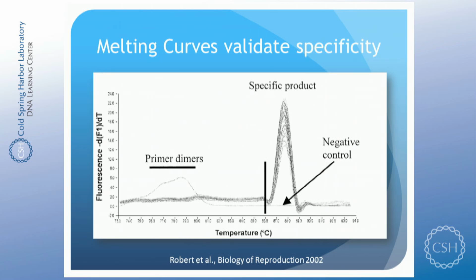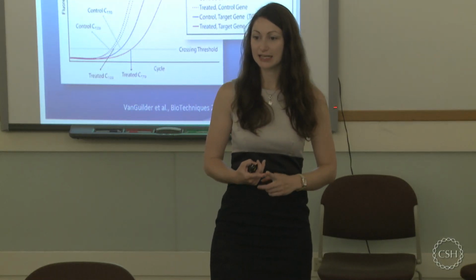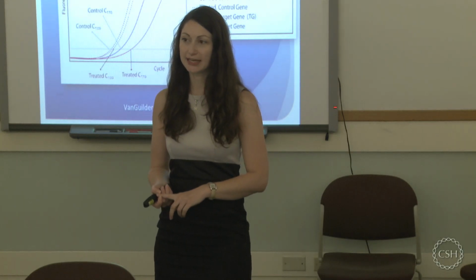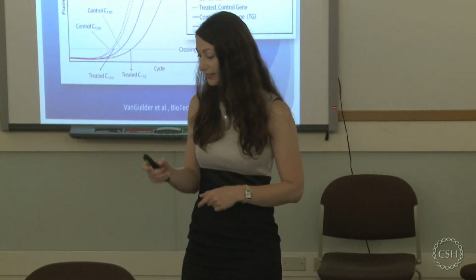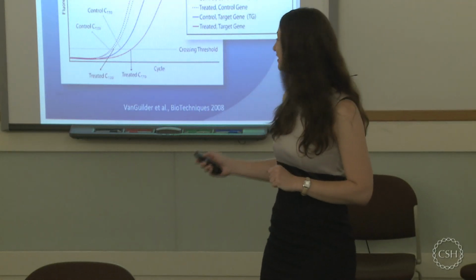Okay, I have to hurry a bit, I'm sorry. The last thing I want to talk about is how to analyze qRT-PCR data. Most people, I guess, still use the delta-delta CT method, so that's why I'm talking about that one. I will give a short note about primer efficiencies and other methods in the end.